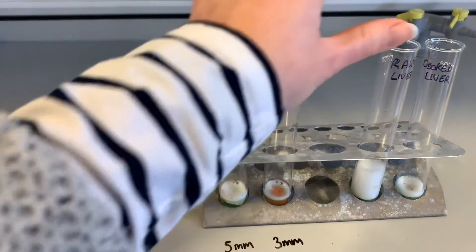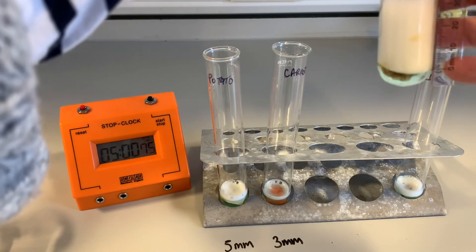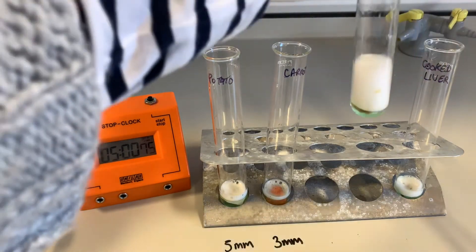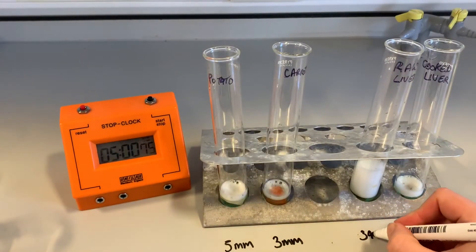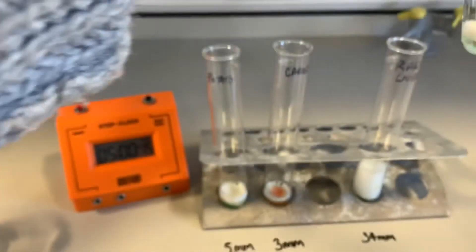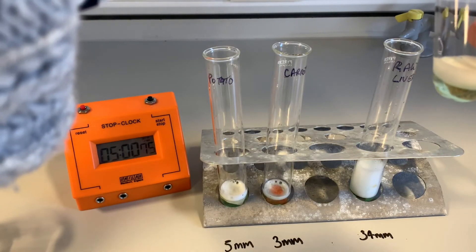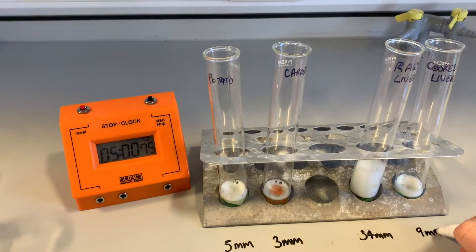For the raw liver we have got 34 millimeters. And the cooked liver has actually been able to produce still nine millimeters of froth. So why has that happened?